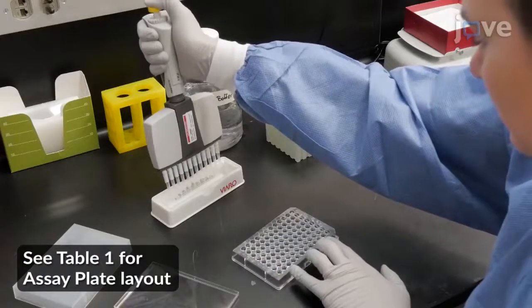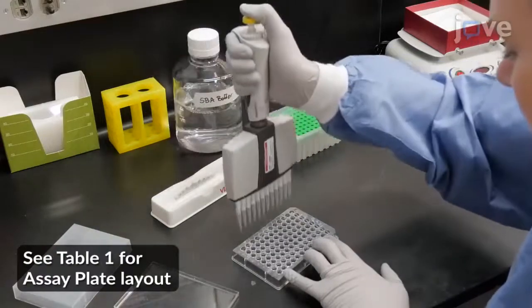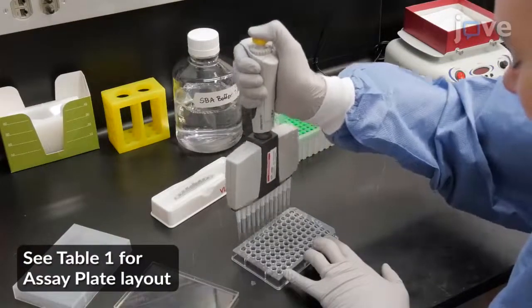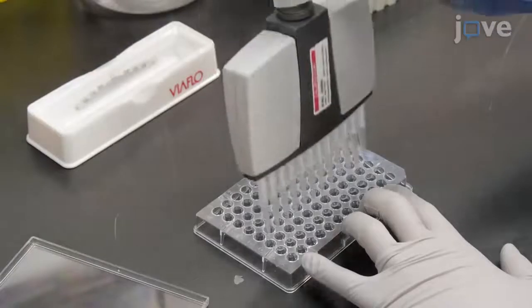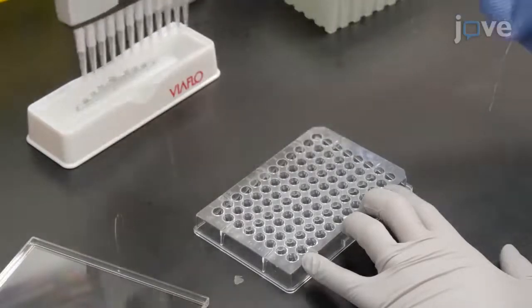Obtain an assay plate and add 20 µL of assay buffer to columns 1-12 of rows A through G. Add 20 µL of assay buffer to columns 1 and 2 of row H.